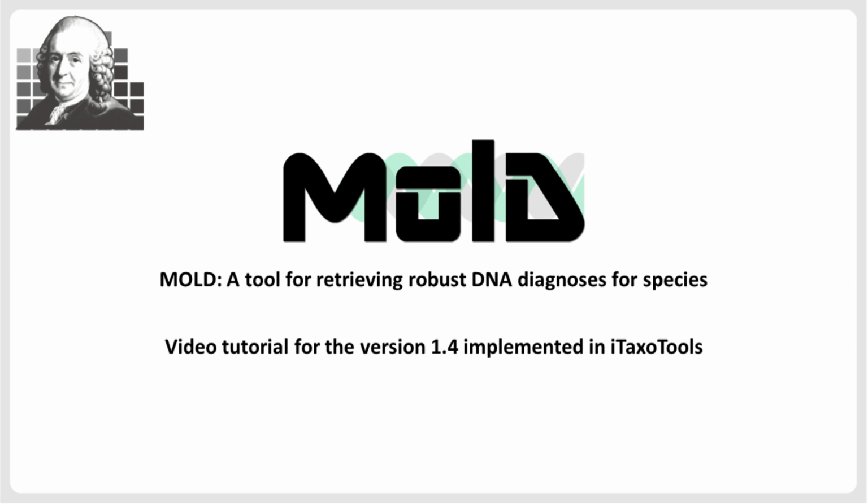Welcome to this tutorial for MolD 1.4. MolD, an acronym for molecular diagnosis, is a bioinformatic tool designed to identify DNA-based diagnoses for taxa. DNA-based diagnostic characters can enhance the formal description of taxa, and reporting them is important to satisfy the requirements of nomenclatural codes in cases where no reliably diagnostic morphological character states exist to define a new species.